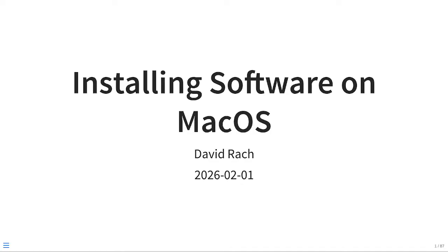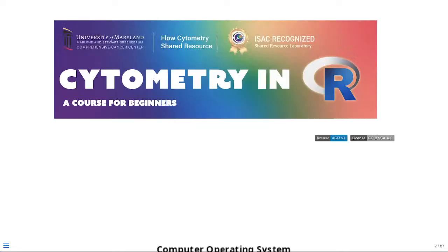So, Cytometry in R, for those of you who are aware, is a free weekly mini course covering a lot of the different materials. It's meant for beginners in coding, but who have some flow cytometry experience in the past.